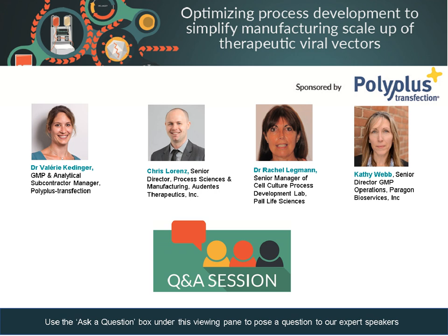Thank you. And then Rachel, how about from your perspective? Yes, thank you for the introduction, and thank you everybody for joining the webinar and letting me express our Pall experience on that. So I would say as you're going to larger scale, you are facing a challenge of lot-to-lot variability because of the large volume. You have to remember that the challenge currently is the cell line that we are using. The transient transfection is a very big bottleneck for this process, and also the variability of the material that you are putting into the process.